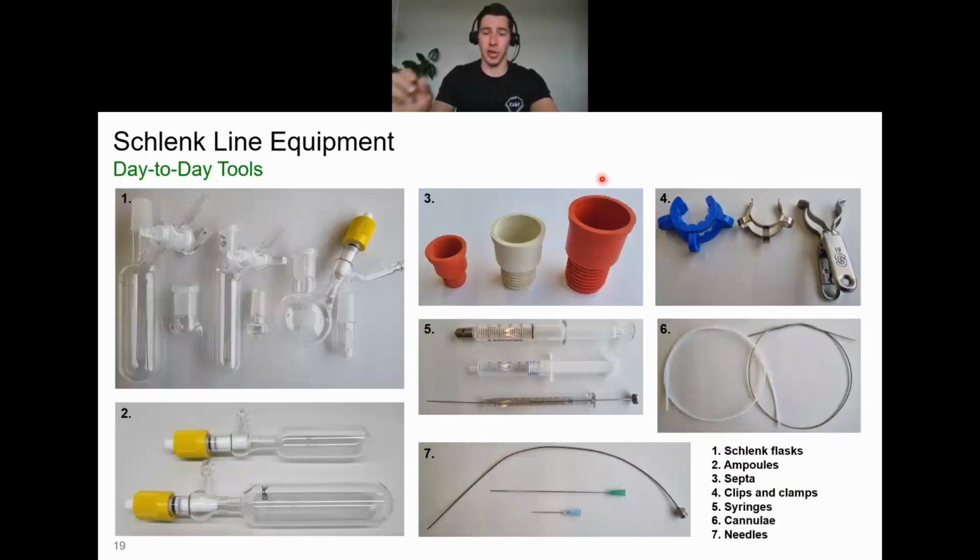I've shown a lot of illustrations, so I just want to very quickly show some pictures of some routine equipment. Shown here are some Schlenk flasks. This on the left side is a male flask, so these are really useful if we want to dry some solids under vacuum before putting them into a glove box. It means that the grease will never come in contact with the solid here. And instead of a stopper, we have this Schlenk cap, often called a Viking helmet if it has these spikes attached. These are really valuable to have in your arsenal.